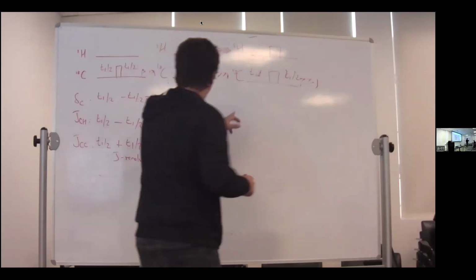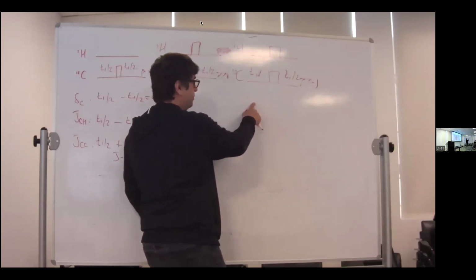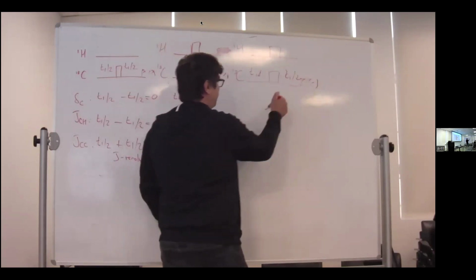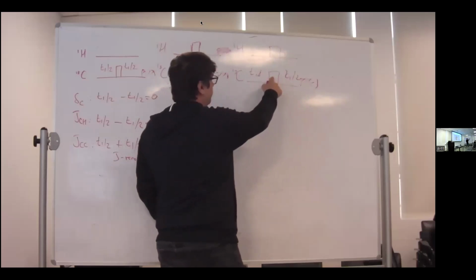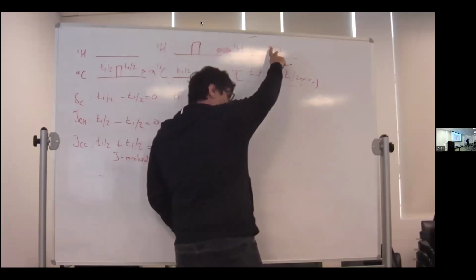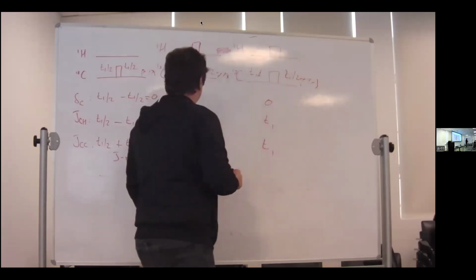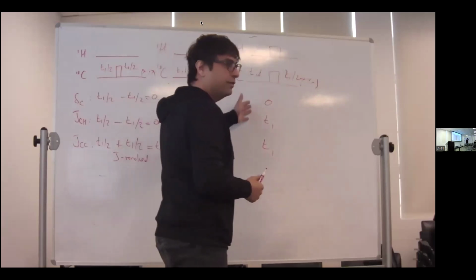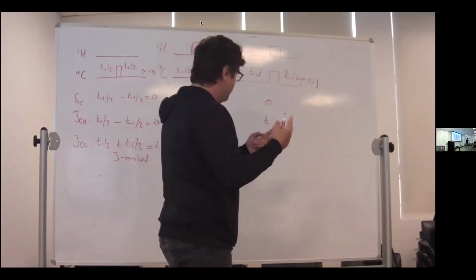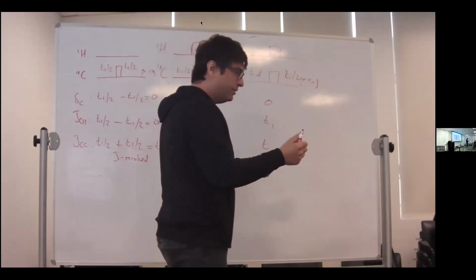Okay, what is this? So let's go through this one. So carbon chemical shifts, we focus on this one. CH couplings, T1, sorry, CH couplings T1 because you have two elements. CC couplings. So no chemical shift evolution. But now you get two different multiplets split by the CH coupling and by the C spin.